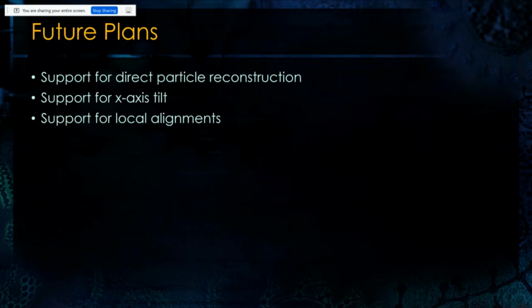And with that, I would also like to mention that this is not a dead project. We haven't been updating it for a while, but right now, there is someone working on support for direct particle reconstruction. So if you already have your particles, and you have only a few of them per tomogram, you might not want to reconstruct the whole tomogram, just directly the particles. It will still be the same implementation, only it will save you, I guess, some time and storage space.